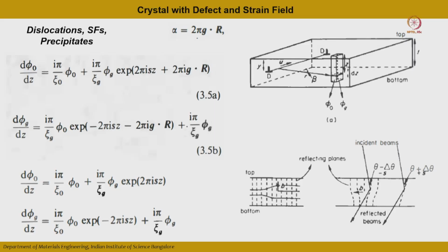So welcome to this class. In the last class we described image contrast, and we described the intensity variation as a function of S and T. These two are very important, and also the importance of ξg, which is the extinction distance. Now we will see how this contrast is used to analyze the defects in the samples. So I will just briefly get to the examples.